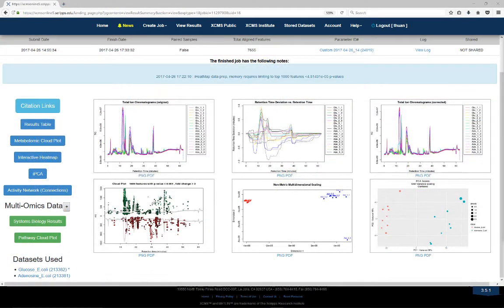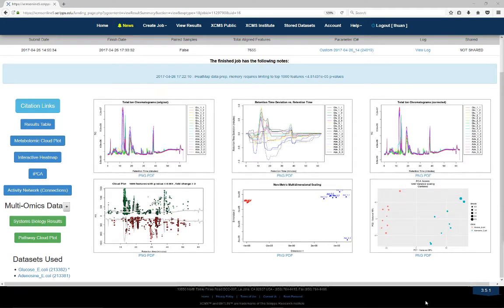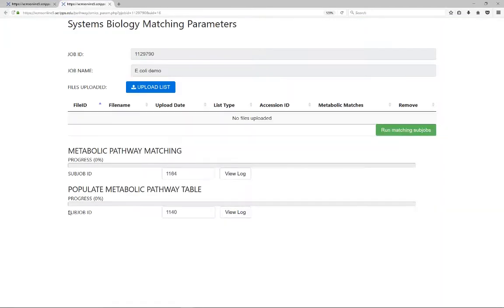Hello, my name is Erica Forsberg, and I'm going to talk to you about how to perform multi-omic integration on XCMS Online. Press the plus button beside Multi-omics Data to open the Systems Biology Matching Parameters window to manage the subjob for omics integration.